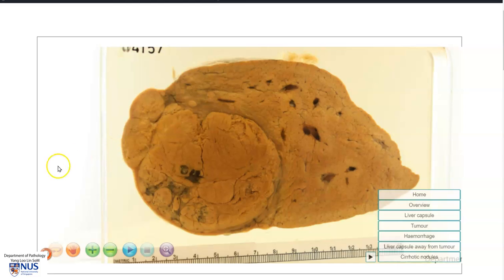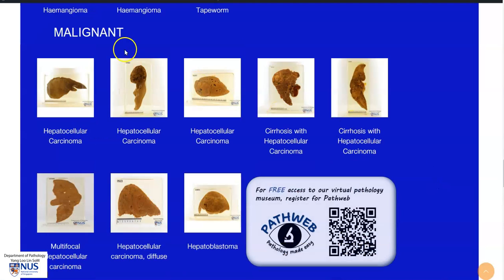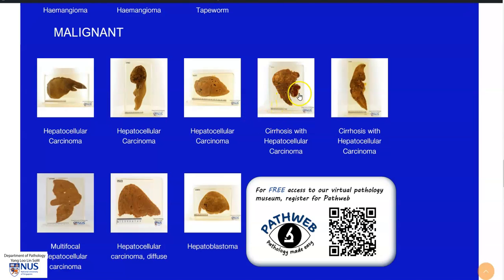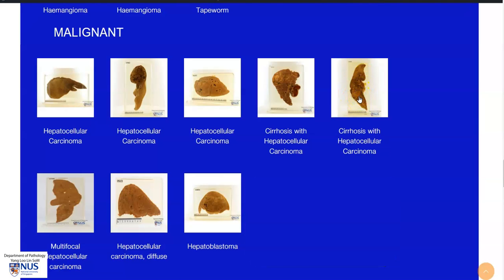Let's look at one other example. As you can see here, there are several examples of hepatocellular carcinoma — some of them not occurring in the background of cirrhosis, and others occurring in the background of cirrhosis. Let's have a look at this example where there is underlying cirrhosis.